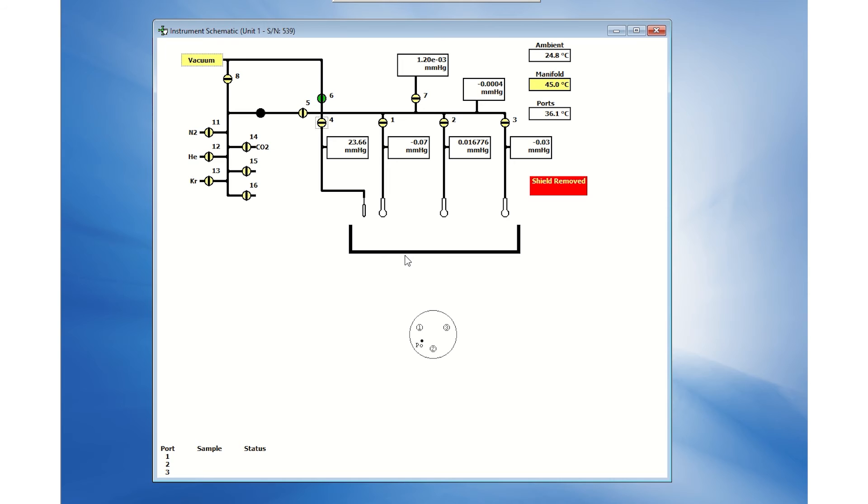When the pressure stabilizes, it indicates the vapor has been thawed. Repeat the freeze-thaw method two more additional cycles until the vapor is free of impurities. Typically, three total freeze-thaw purification cycles are sufficient.